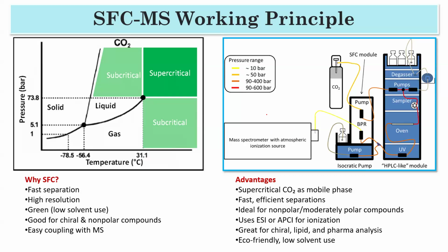Okay, so this is the configuration. You have the carbon dioxide cylinder and you have this SFC module. SFC is just supercritical fluid, okay? So the CO2 gas will go to the pump, and your sample will be here, just like a mobile phase. So CO2 will go and then your sample will move, okay?